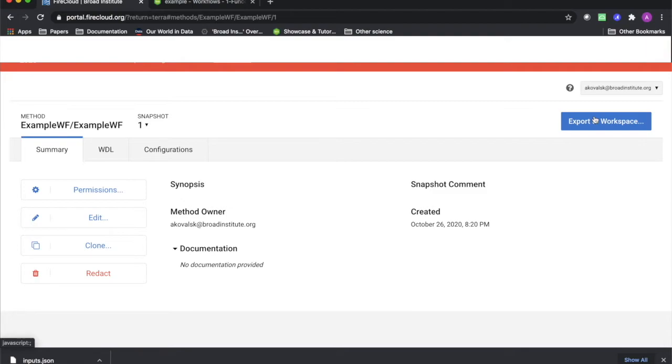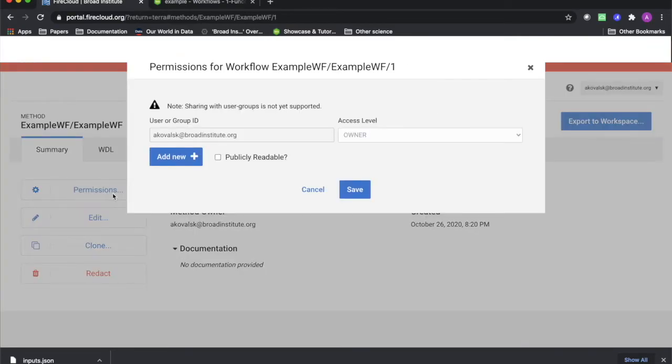Note that if you wish for this workflow to be available to other individuals, groups, or to the public, you would modify the permissions on this page now by clicking Permissions to see this popup.